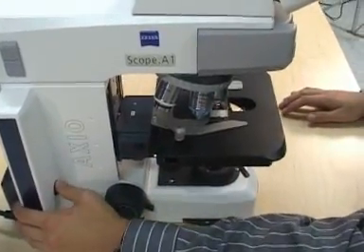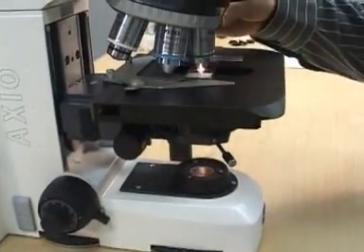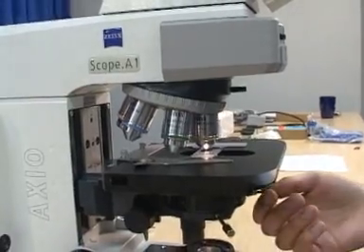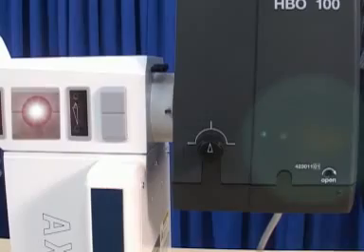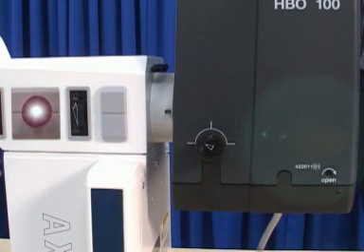Switch on the power supply for the HBO 100. Open fully the reflected light field diaphragm. Set the fluorescence attenuator to 100% and make sure the slider next to it is in the open position on the upper part of the microscope. Pull out the adjustment aid — you should now see two rectangular light spots in the center of a small circle. Focus the collector of the HBO housing by turning the black knob until a sharp image of the rectangular light spot is visible in the circle.